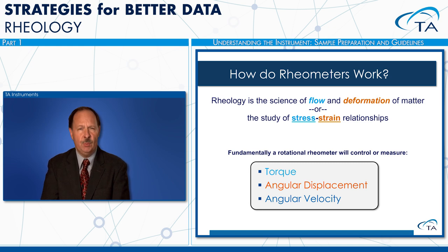Okay, so again, we give the definition of rheology: the study of flow and deformation, the study of stress-strain relationships. The key things that we will be concerned about when we do our rheological testing are the torque, the angular displacement, and the angular velocity. These are the three machine parameters that we will use to get the rheological parameters that we're after.